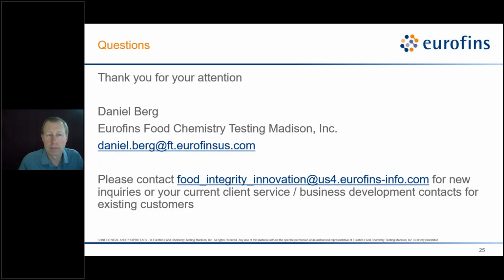The first question is, what do I do if I'm unsure of what protein testing method is best for my product? Okay, let me answer that in two parts. So you're unsure of what testing is for your product. As I went through in the presentation, there's a number of questions that you need to ask as far as the purpose of the testing. So, are you interested? Is this for a claim?